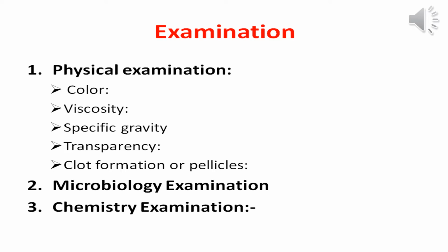And the negative stain you can prepare by mixing 1 drop of the CSF sample with 1 drop of negative stain like eosin, for example, mixing very well at one end of a clean slide. Then you can spread it as you spread the blood film. Under the microscope you can see the microorganism surrounded by a huge, colorless capsule, and this capsule stain or negative stain is used to detect Cryptococcus neoformans, because as you remember Cryptococcus neoformans has a huge capsule.